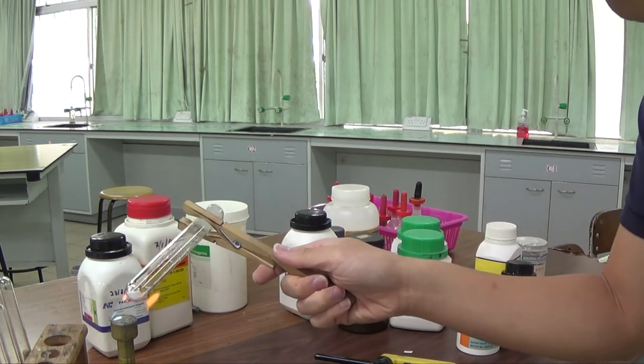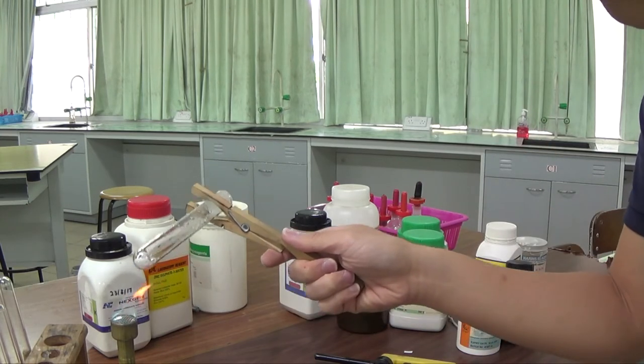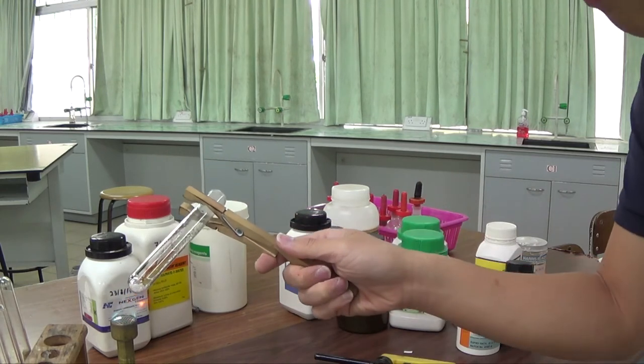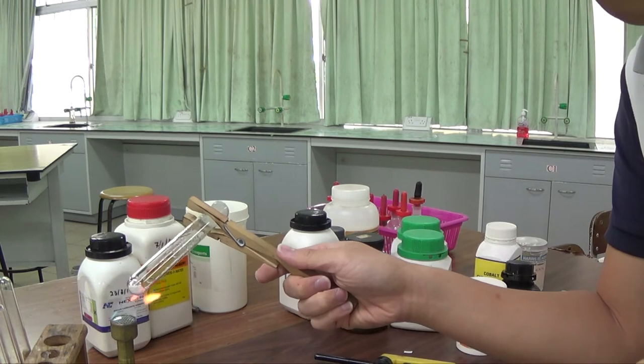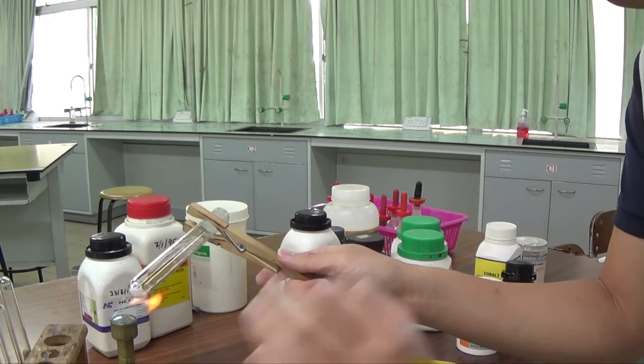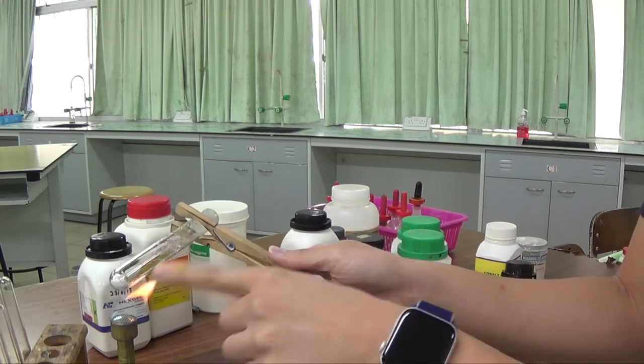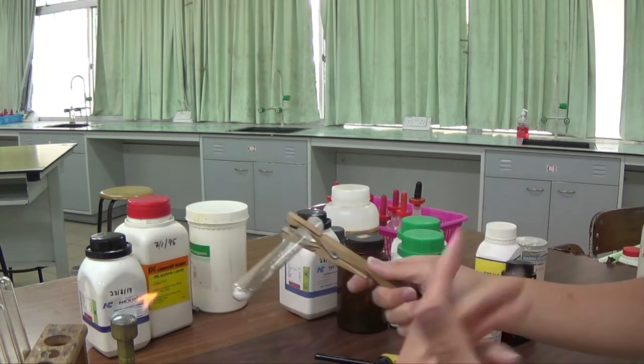Not that cobalt chloride paper which I had earlier. That was an old one. Okay, so this can also be a real practical experiment: how can you ensure all the water of crystallization has been driven off? Well, you need to heat the solid well to get rid of all the water.